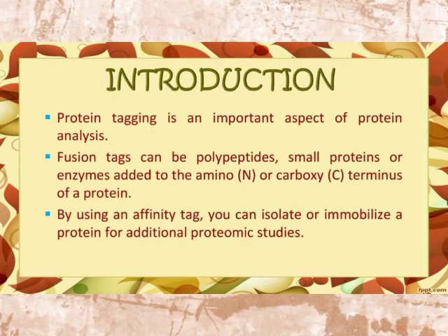As you have selected a protein for biochemical studies, and if you have cloned that particular protein into a tag containing vector, so what will happen? After successfully expressing your protein in a suitable form, what you need to do is pick it out from the proteome pool of the expression system. So an affinity tag, just like an identity card, allows you to identify and separate your protein from a particular mixture. So protein purification affinity tags enable your protein to bind with particular molecules, leaving behind other, that means non-tagged, proteins.